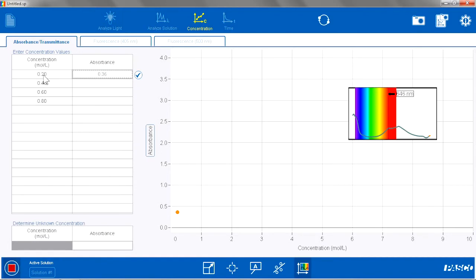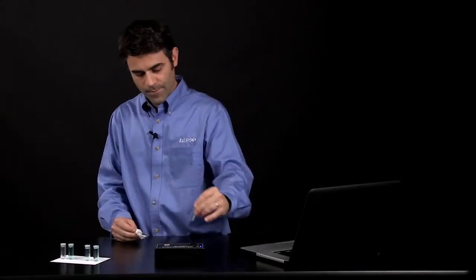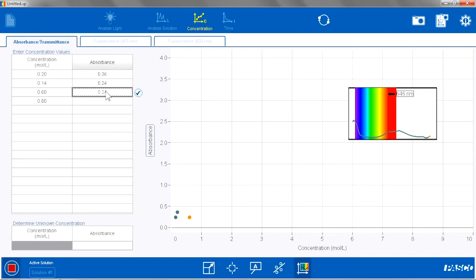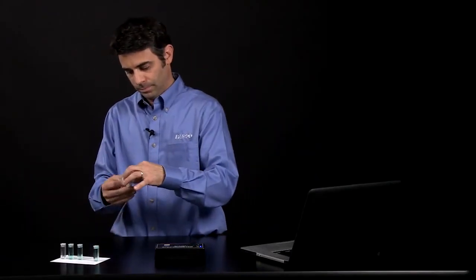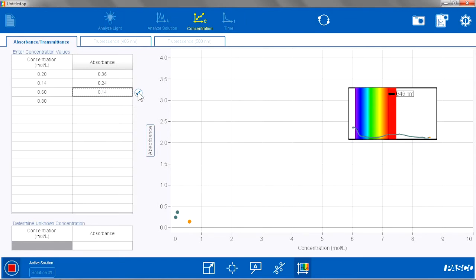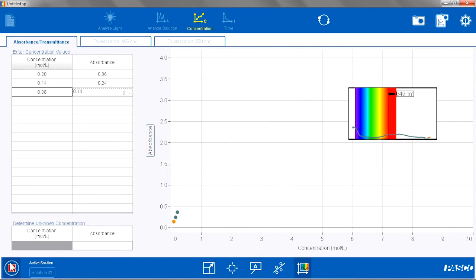In this case the concentration is 0.2, so I am going to hit Check to save that absorbance. I am going to put in my next standard, wait for that to stabilize, and hit Keep the value, changing the concentration to 0.14. I am going to go to my next solution, again wait for that to stabilize, hit Keep the value, and change the concentration for that, which was 0.08 molar. I am only doing three standards this time, so I just have those three. Now that I am set, I will hit Stop.